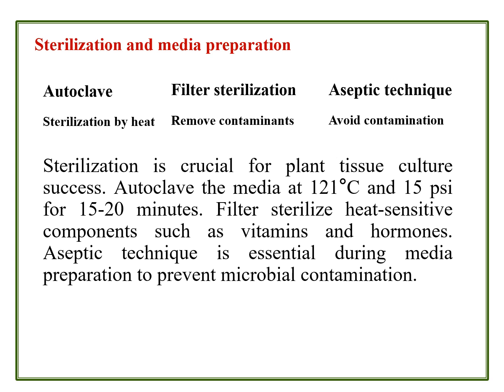The mode of action of the autoclave, that is moist heat, generally breaks down the cellular proteins of the microbial forms, and the gram negative and gram positive bacterial cell walls can easily be broken by the moist heat, at 121 degrees centigrade and 15 psi pressure for 15 to 20 minutes.